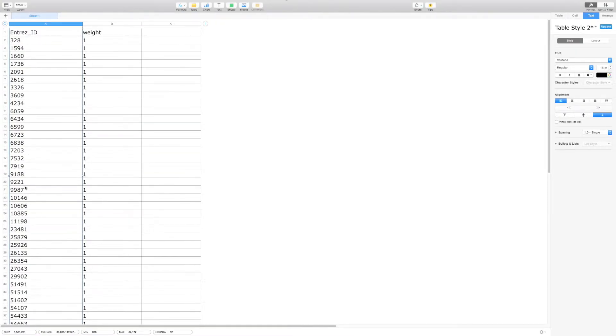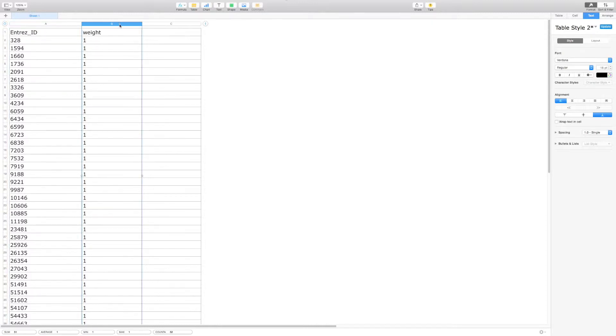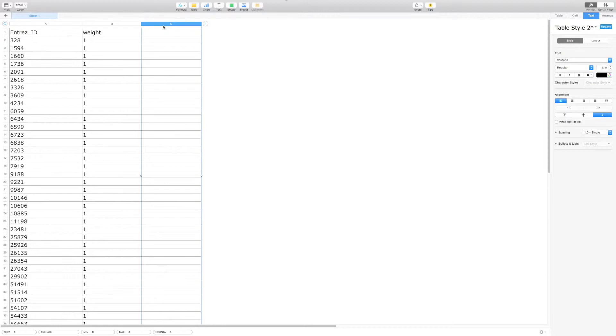The gene set file can have two or three columns, where the first column indicates gene Entrez ID. The second column specifies weights, and an optional third column indicating the gene set name. You should include the third column if you want to upload a file containing information of multiple gene sets.